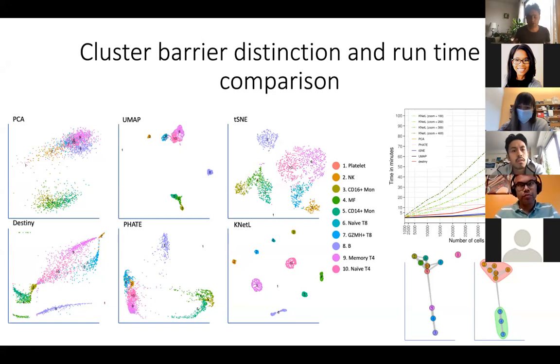However, imagine if you have large projects such as the mouse cell atlas, where most people have spent so much time doing broad clustering to define the clusters. It would be helping you a lot there. I would show you a couple of slides, and then it would reduce the time in that sense.